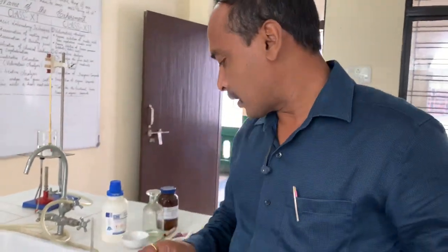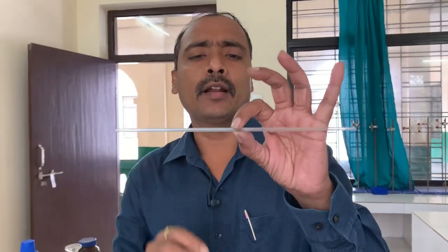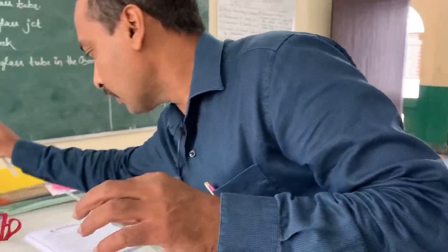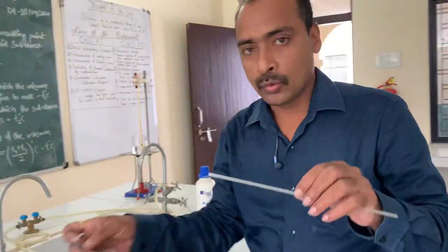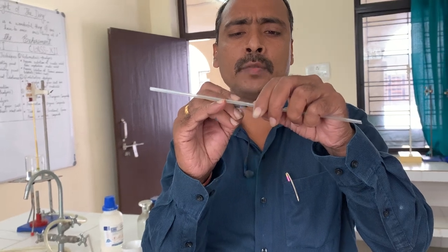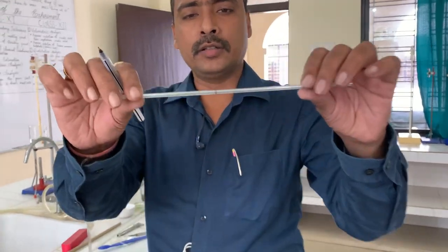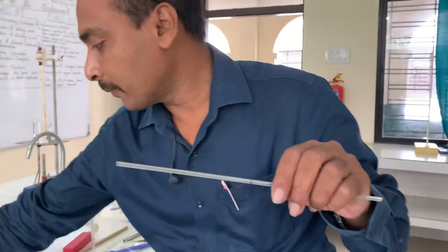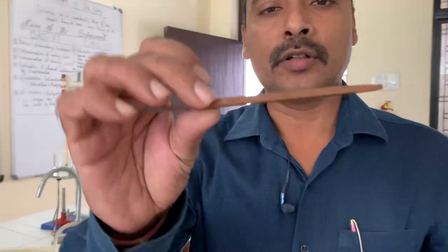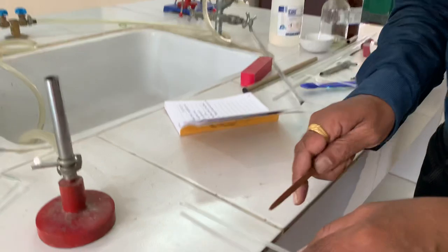First, you take the glass tube. At the middle of the glass tube, you mark with a marker pen. You circle one line — this is your mark. At that mark, you use a triangular file — triangle shape — with the help of your hand.